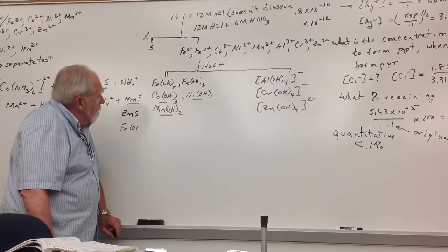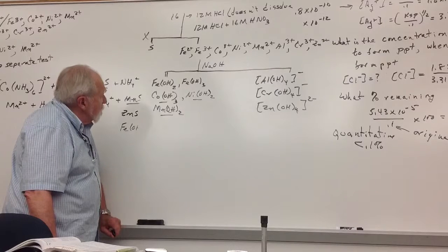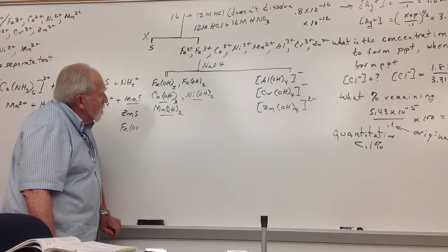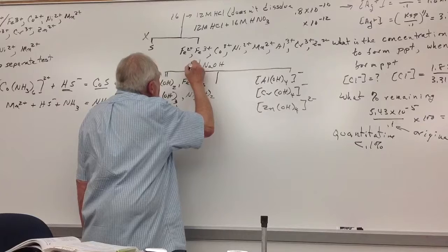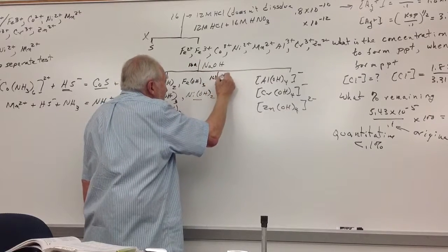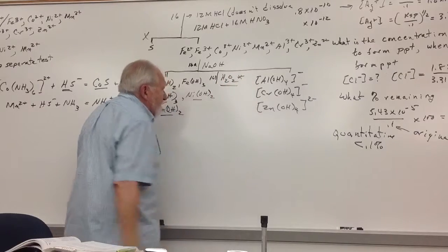The next thing you want to do, and I think you have cobalt 2 hydroxide also. The next thing you want to do while it's in the casserole is add, and this is 16A, I guess, 16B, hydrogen peroxide. This is the important step right here.